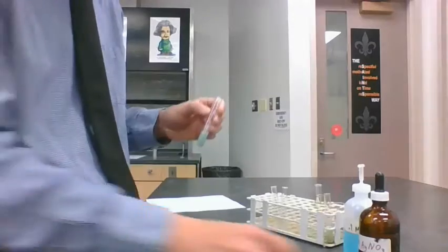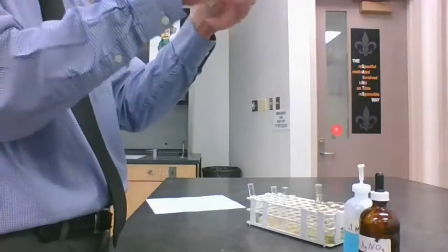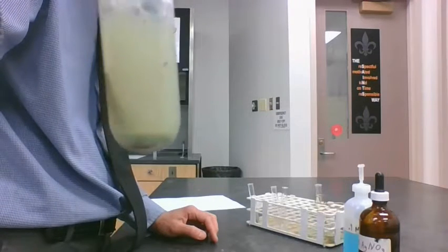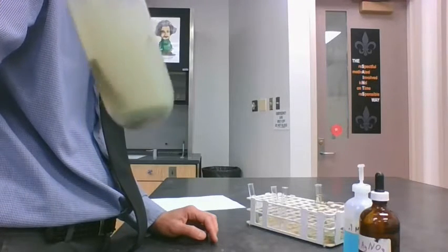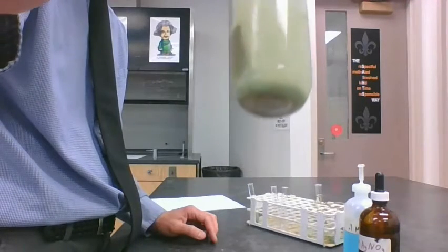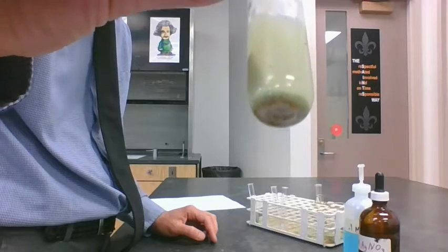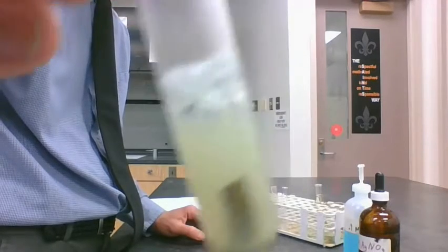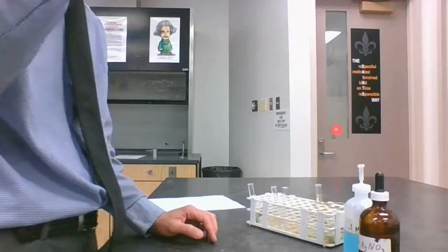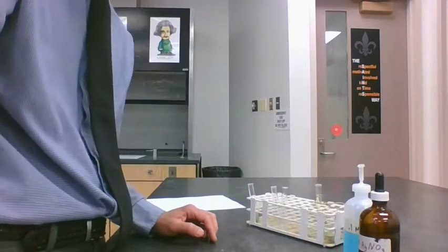So when we were in class, we're just going to keep this one going. I started one before, so you can see the final product. The final product here is a cloudy solution, which is not blue at all anymore. On the bottom, a brownish solid is formed all over the bottom. The color's maybe a little bit tinted yellowish. It looks like rust.